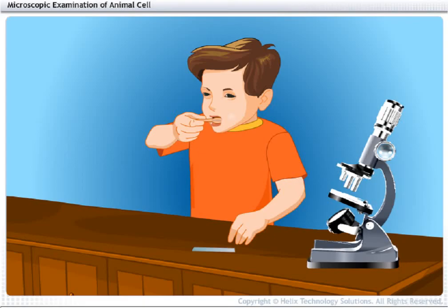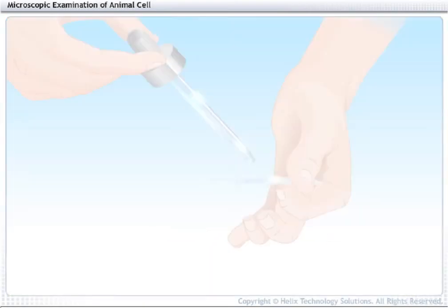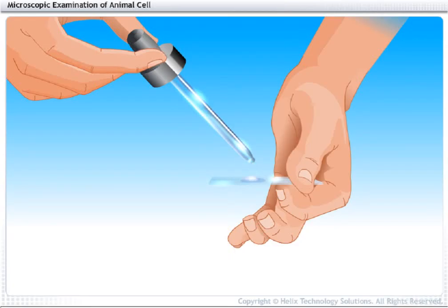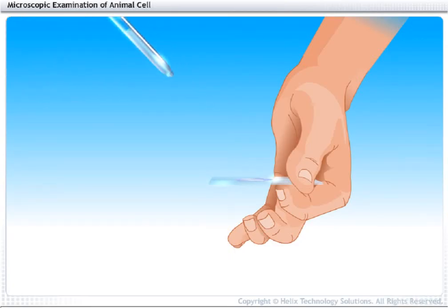Scrape the inside of your cheek using the spoon. Spread the collected mass in a drop of water on a glass slide.